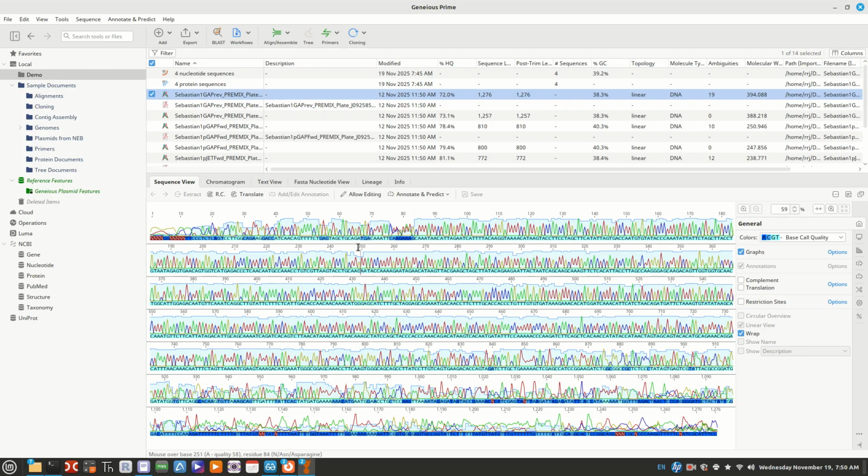We get some ambiguity here a little bit, but it's decided to tell us what it is anyhow. Do we have any Ns there? No, it makes the decision for us. I would be suspect of this, but obviously their sequencing wasn't, and they say that's what this is. That one, I would be very suspicious of that piece right there. But otherwise, this looks pretty good.